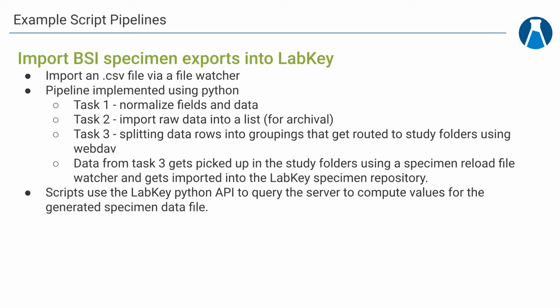One of the interesting parts of this one was that it was actually using the Python API to get some metadata from the server as well, to integrate that with the data that was being added.